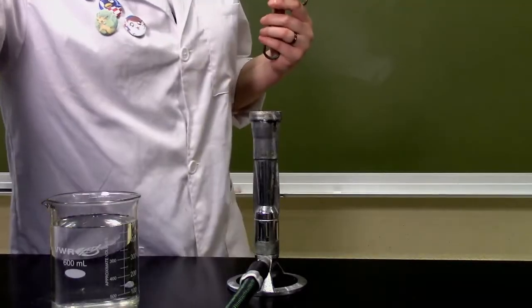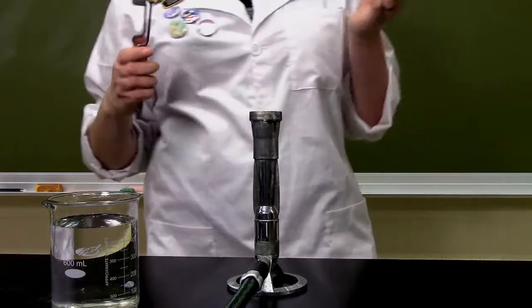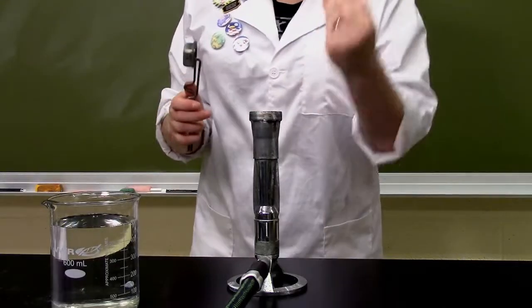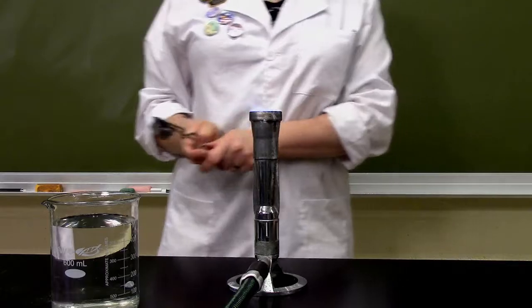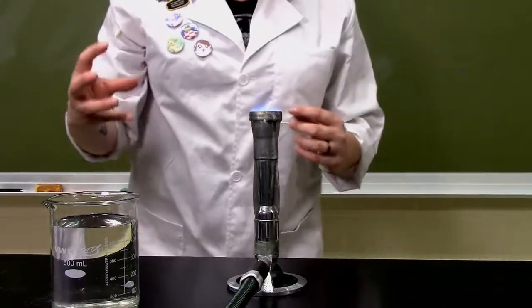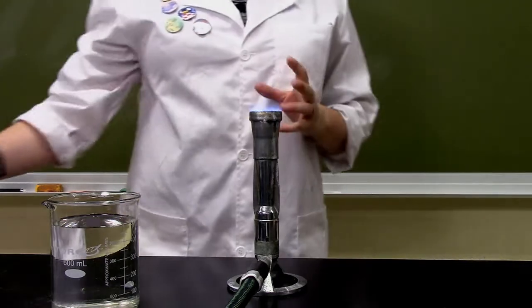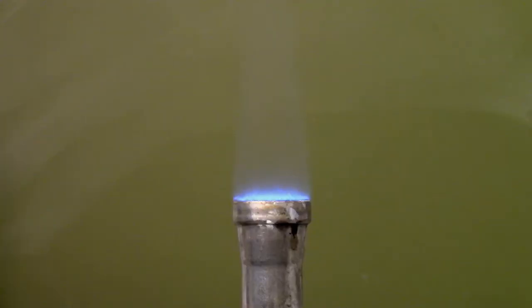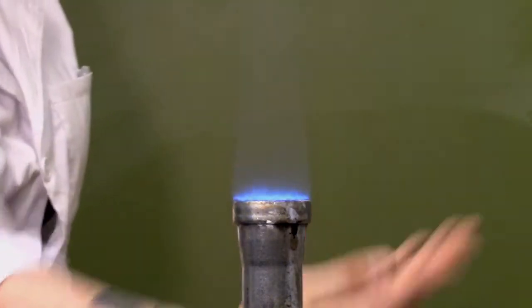So I'm going to open up the valve, and y'all probably can't hear it through the microphone, but I can hear the gas actually coming out of the Bunsen burner. So let's light it. There we go. Beautiful. Let me actually zoom the camera in on the flame so that you can also see the penny reacting. Look at this beautiful flame from our Bunsen burner.